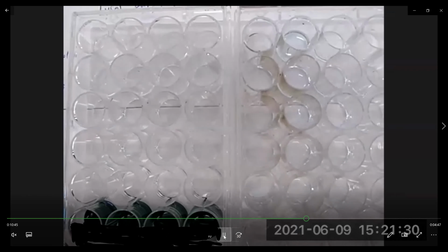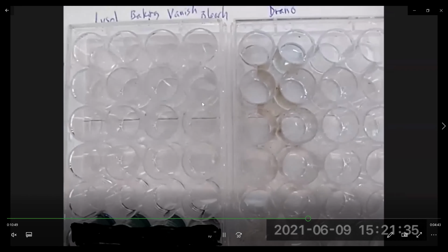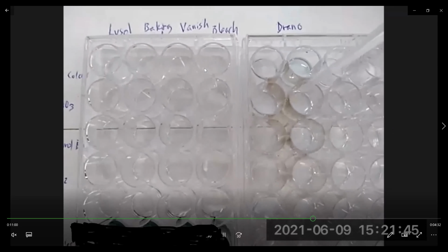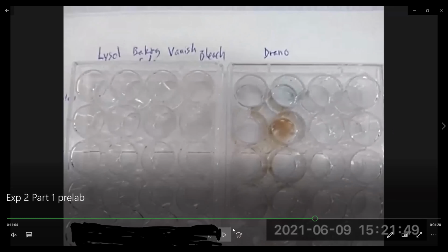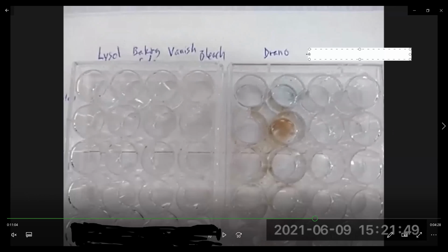Next we're adding the silver nitrate. And so you see with the silver nitrate, when we added it to the Drano, we get a brown precipitate. So remember with Drano, we said that sodium hydroxide was the key ingredient.